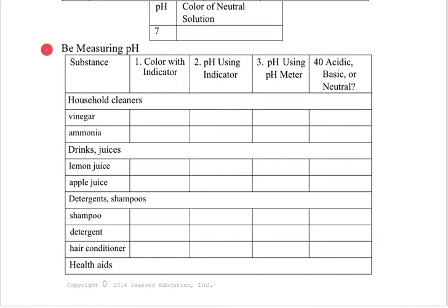So this is part B. Again, the formatting is a little different than yours. In the part B video, what you're going to see first is this part. I'm not using a pH meter. Instead, we're using pH paper here. It has indicators within the paper. When you place a little bit of vinegar on the pH paper, it turns a red color, indicating the pH of the solution. It's like a test strip. And then in the video, you'll match a color to the chart to figure out the approximate pH of all these solutions.